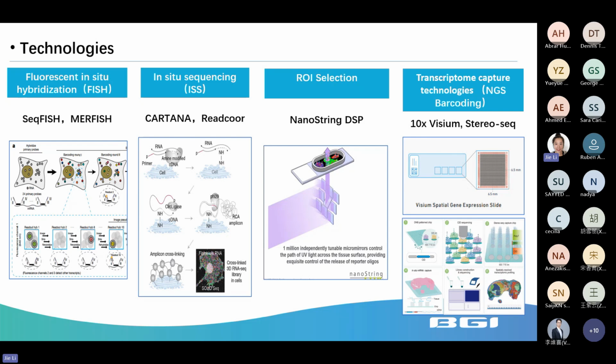And for the last two that we categorize as sequencing-based technology, the most well known are NanoString DSP, 10x Visium, and our Stereo-seq.